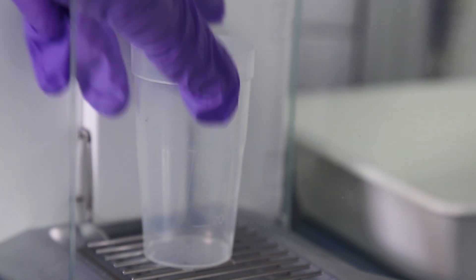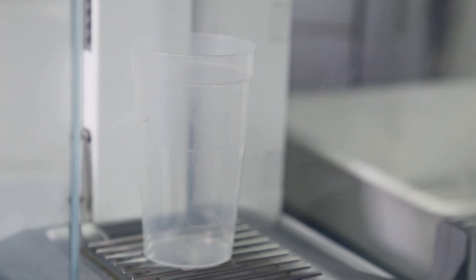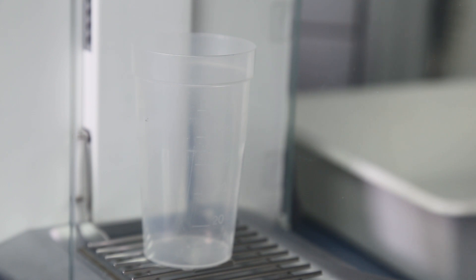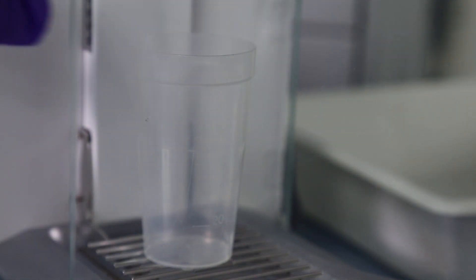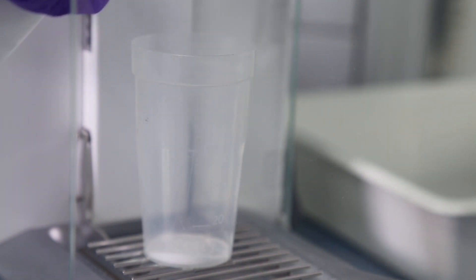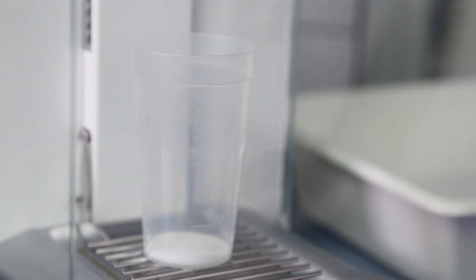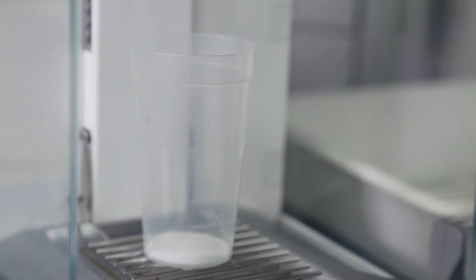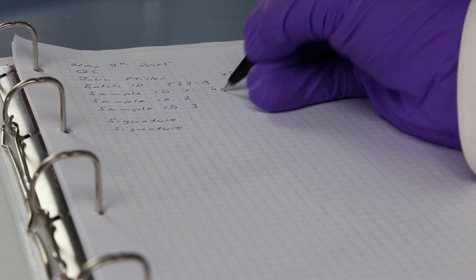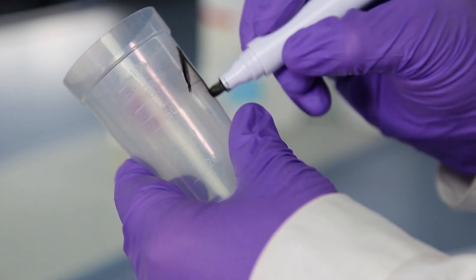As a first step, the titration beaker is placed on the balance and tared. The sample is then weighed in and each result is handwritten into the lab journal. Then each beaker is also labelled by hand.